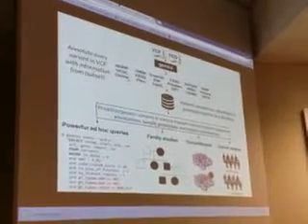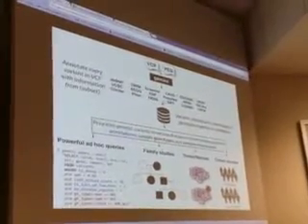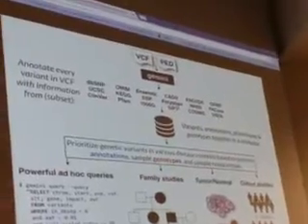And when gnomAD came out, the successor to ExAC, I wrote a simple script to bring in my gnomAD database, and then I can go against that and look to see what variants of mine are in the gnomAD database. So this basically allows you to look at ClinVar. Has it ever been seen in ClinVar? Does OMIM, Online Mendelian Inheritance in Man, show a phenotype associated with that gene? Then you get the KEGG pathways, of course, Ensembl, 1000 Genomes. Here are the CADD scores. I'm sure you heard Greg Cooper talk about his CADD scores. Then PolyPhen and SIFT. So these three here give you a sense of how lethal it is based off of the conservation of those various SNPs.